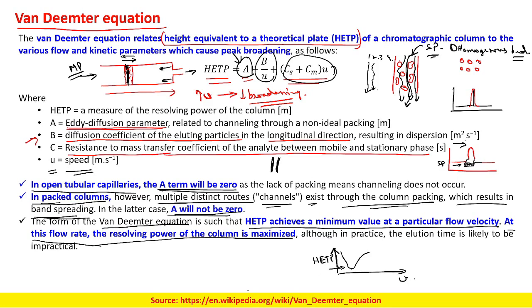That would be the best resolving parameter, or mobile phase velocity, for that analyte if you want to do the analysis.